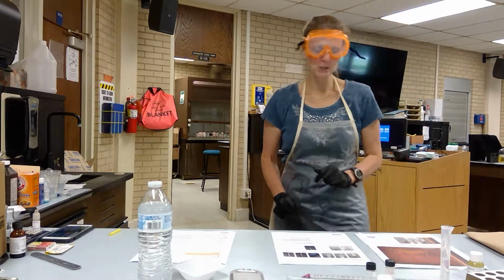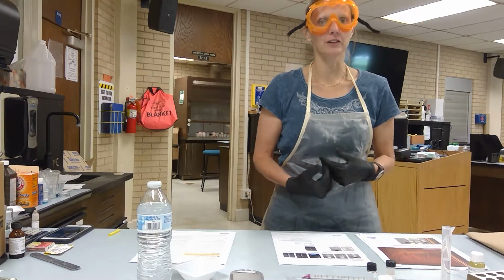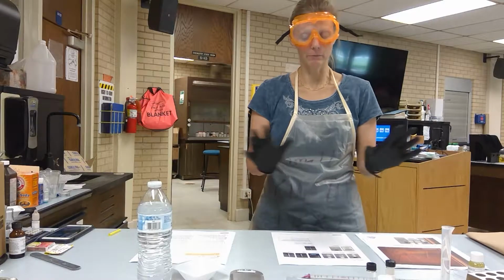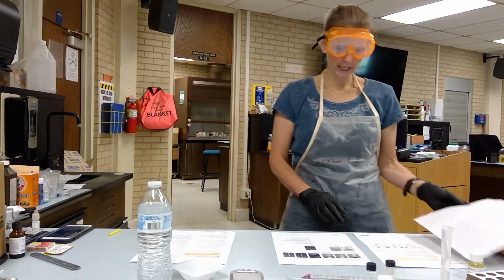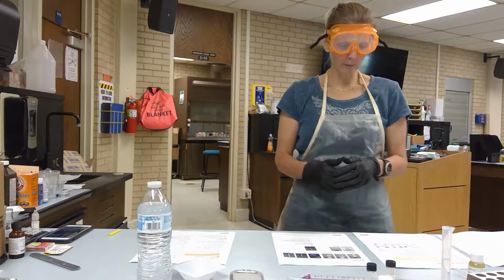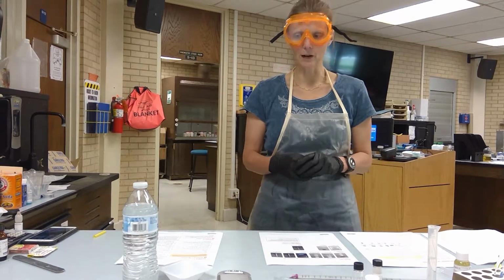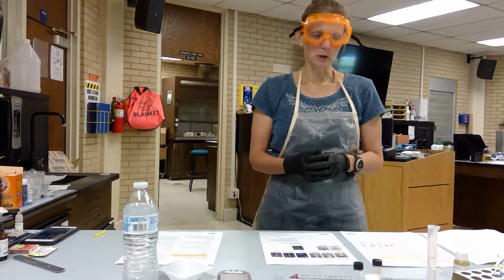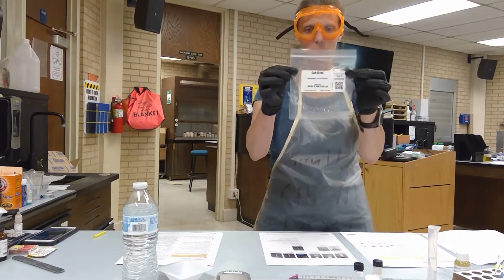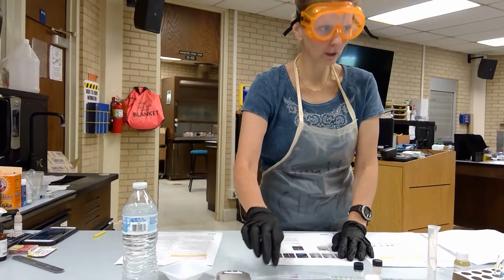Anyway, we are going to do synthesis of biodiesel. This is one of my favorite labs to do. It's a transesterification, big word to work with here, transesterification of vegetable oil. Basically we're going to use a catalyst to produce biodiesel from plain old vegetable oil.